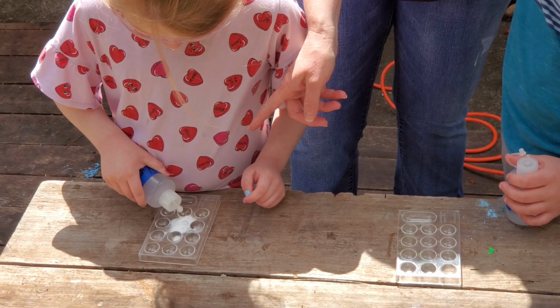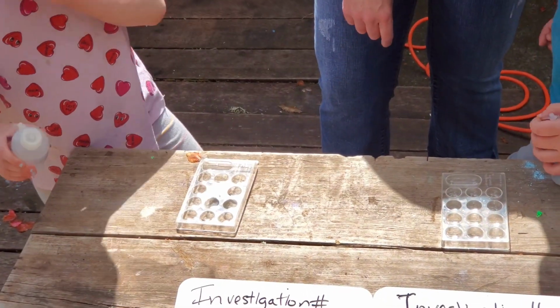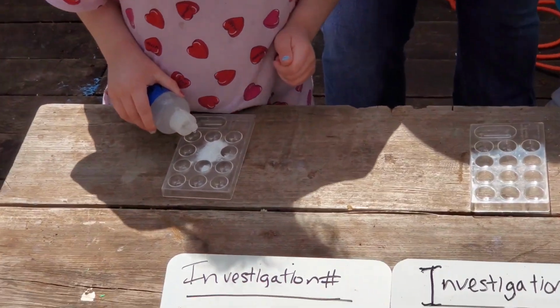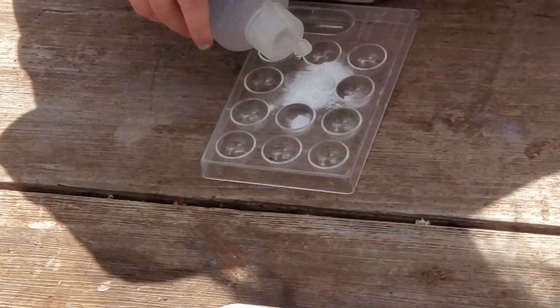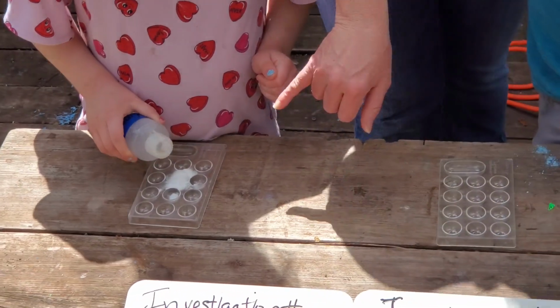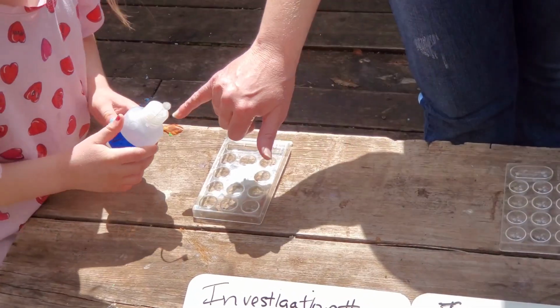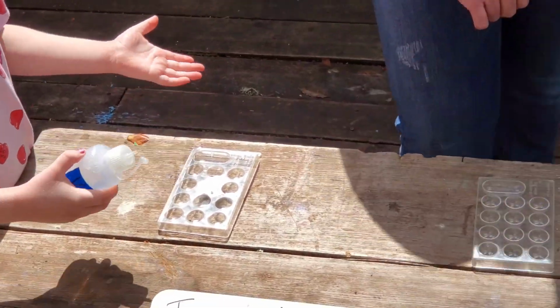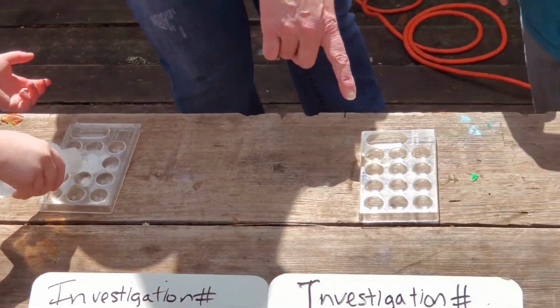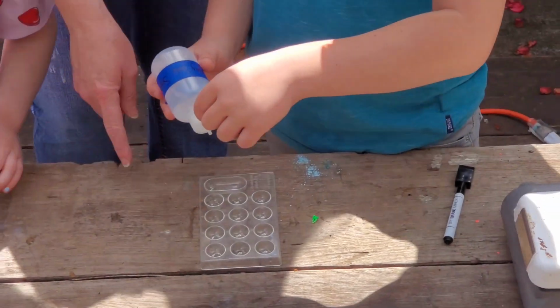What do we see happening? Qualitative data. What do you see? Bubbling. So what state of matter is bubbling? Solid, liquid, or gas? Gas, right. So the bubbling is a gas, so it went from a solid white powder and a clear liquid into bubbling gas. So that was 9. Now investigation 10.